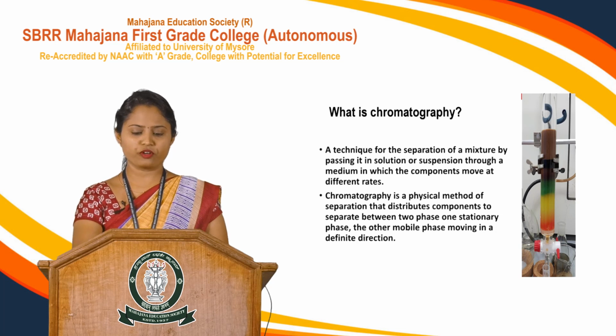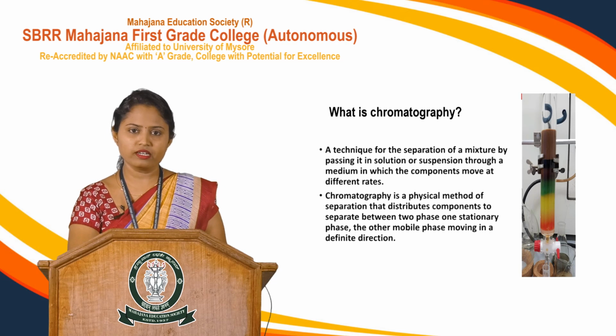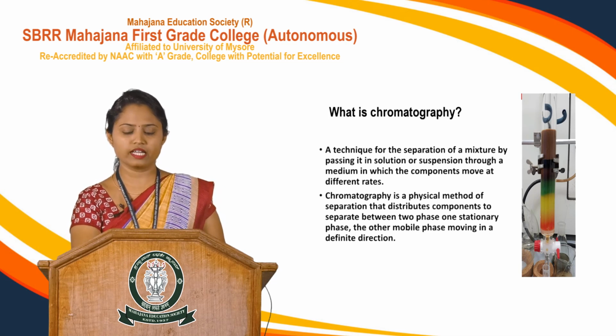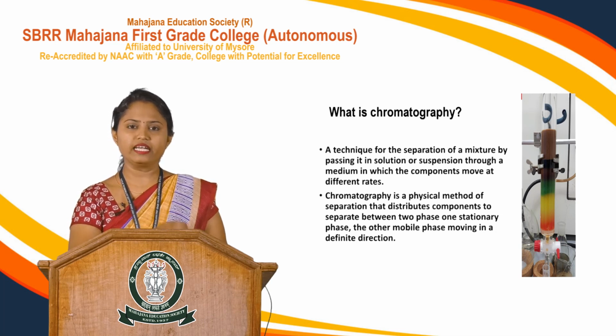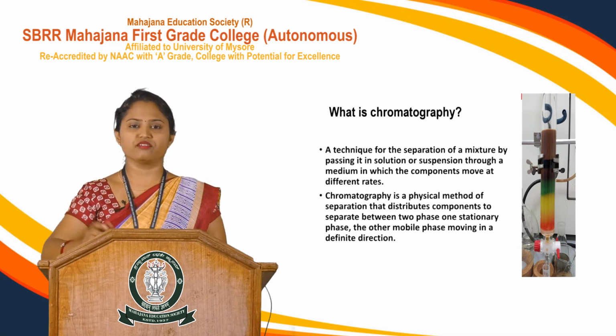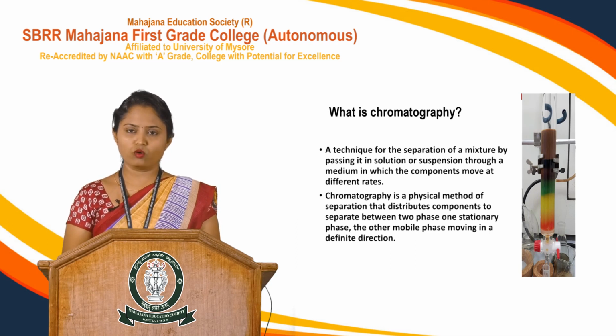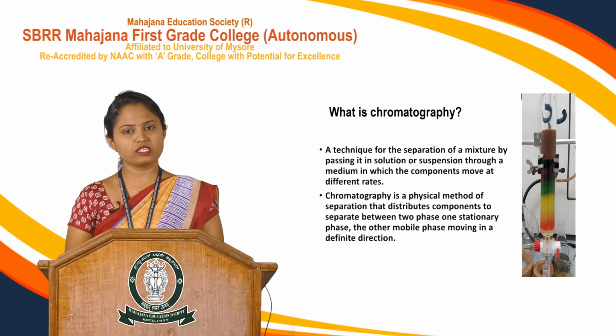Under chromatographic techniques, you can define it as either a biochemical or a biophysical technique, which involves the separation of a mixture of components. You can separate individual components from a complex mixture, where each molecule migrates at a different rate. You can allow the sample, also called the analyte, to pass through a solution or a suspension.